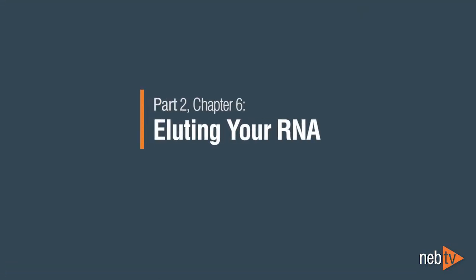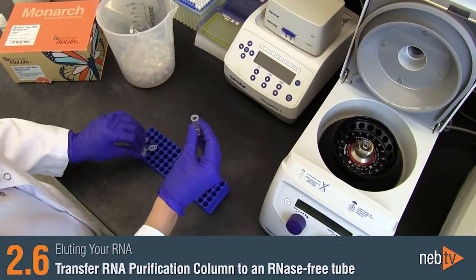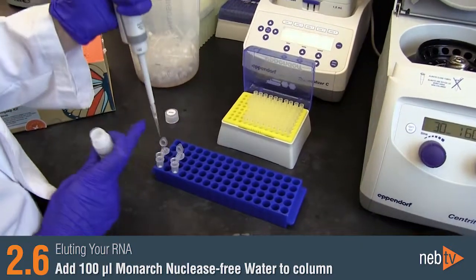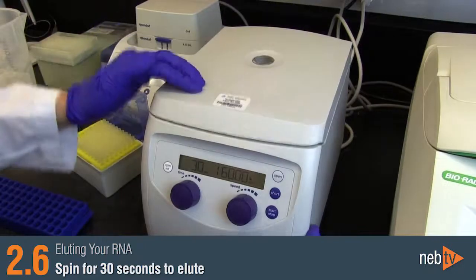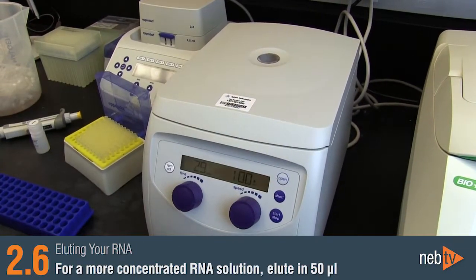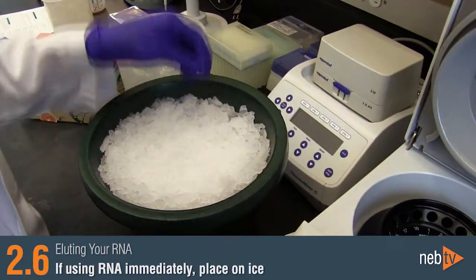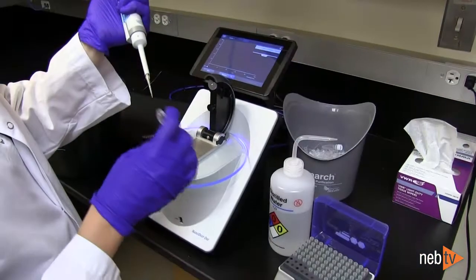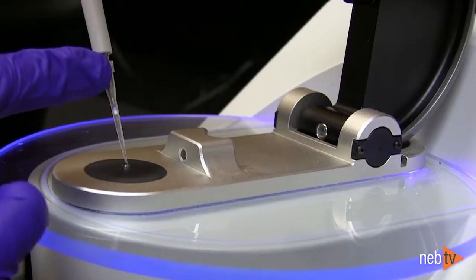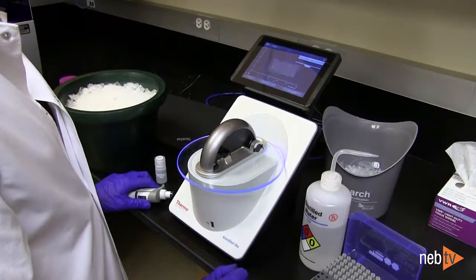Eluting your RNA. Transfer the RNA purification column to an RNase-free microfuge tube and add 100 microliters of Monarch Nuclease-free water to the column matrix. Spin for 30 seconds to elute. For a more concentrated RNA elution, you can elute in 50 microliters. Place the eluted RNA on ice immediately if you plan to use it for downstream applications. Store at minus 20 for up to a week, or at minus 80 for long-term storage. RNA can be evaluated for purity and concentration using a standard microvolume spectrophotometer such as a NanoDrop. When taking a sample to measure, spin the eluate and pipette from the top to avoid any silica particulates that may have eluted from your column.